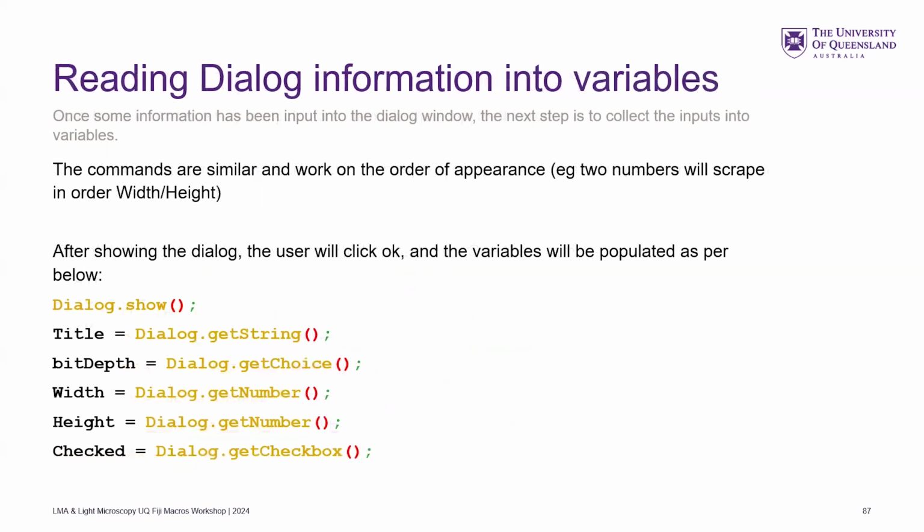There is another dialog type that uses a different format, and it's called the @ string. And that you can get a bit more funky and define maximums. You can define different things as well. But I don't actually cover that in here.